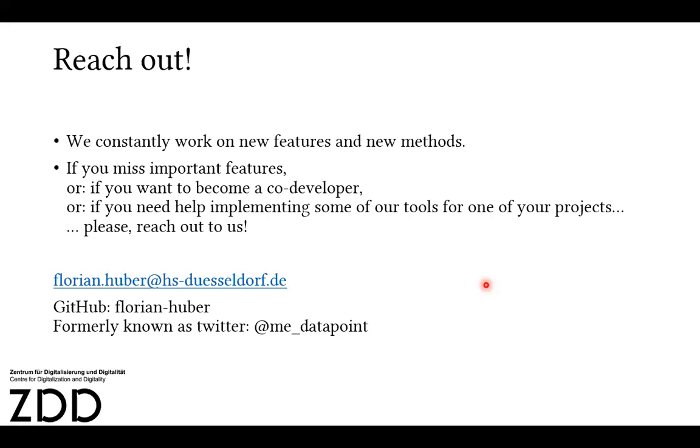Given the small team we have, it's pretty pointless to promise you that you can submit us a wish list and we will build this. But it's still good to see what kind of things you are looking for, and even better, if you are interested in getting your hands a bit dirty and trying to code yourself, because don't be afraid that you are not good enough in coding yet. Don't be afraid of this.